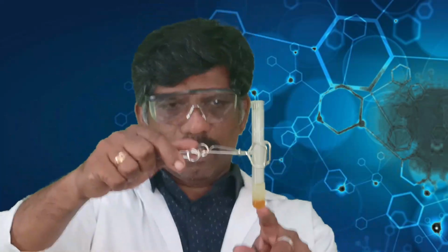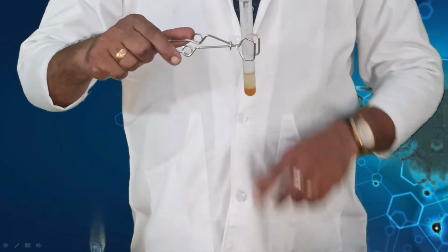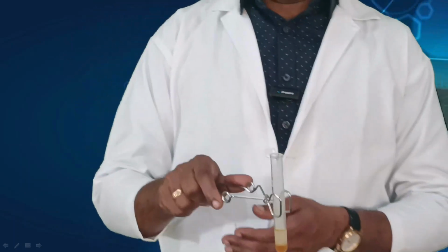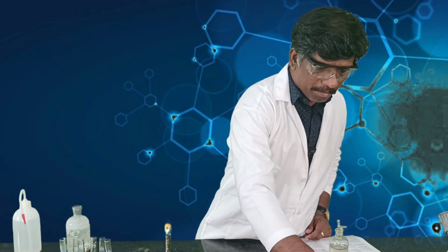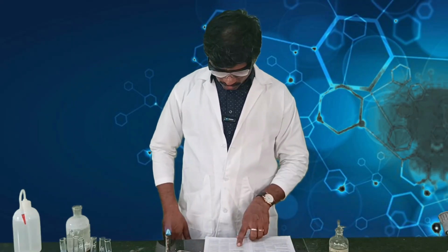Now it is regenerated. The water and amine are separated, and this shows the presence of an amine or organic base in your compound. These are all the preliminary tests to detect the presence of carboxylic acid and amine.